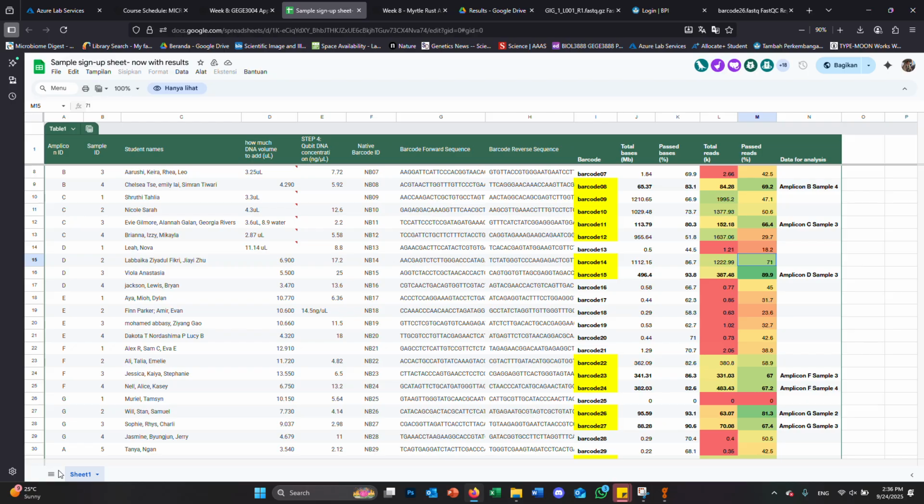So, based on that, instead of using that automated pipeline that Perry was going to show us, I've taken a different approach. I've selected a few successful samples that we're going to use for mapping and consensus sequence analysis. I just wanted to escape from my slides for a moment and go to the spreadsheet. I've highlighted in yellow the ones that, for all intents and purposes, actually worked.